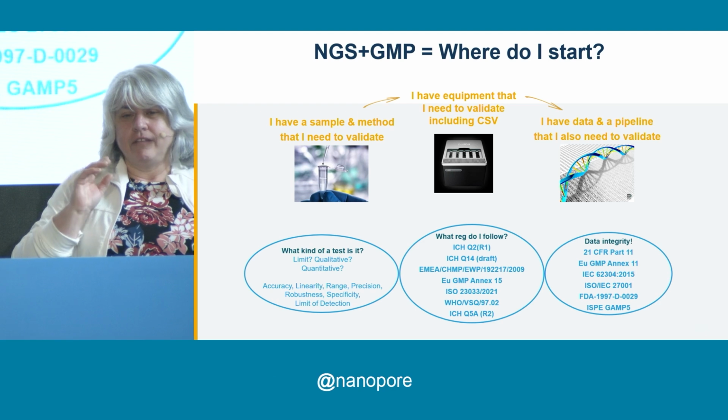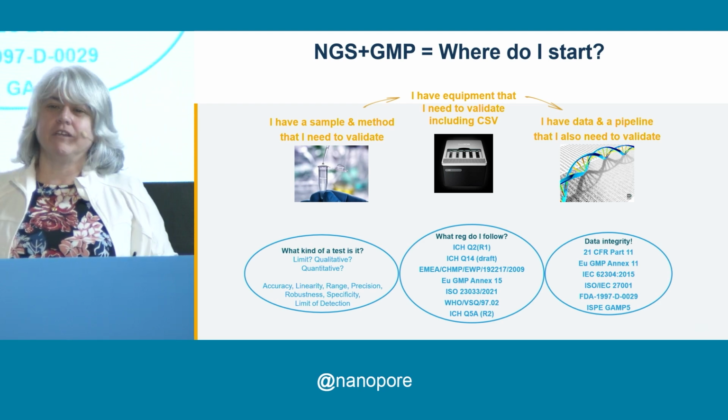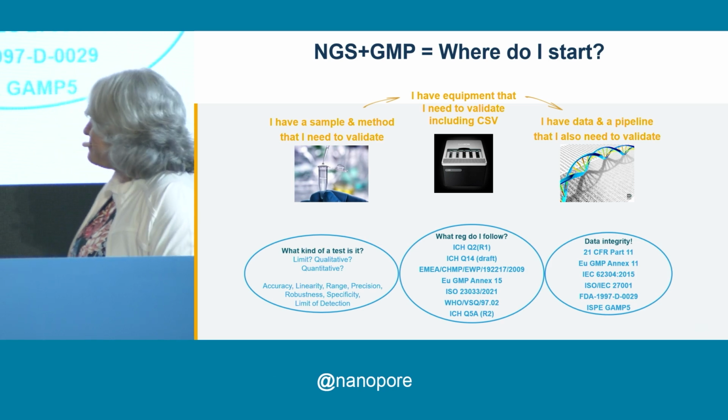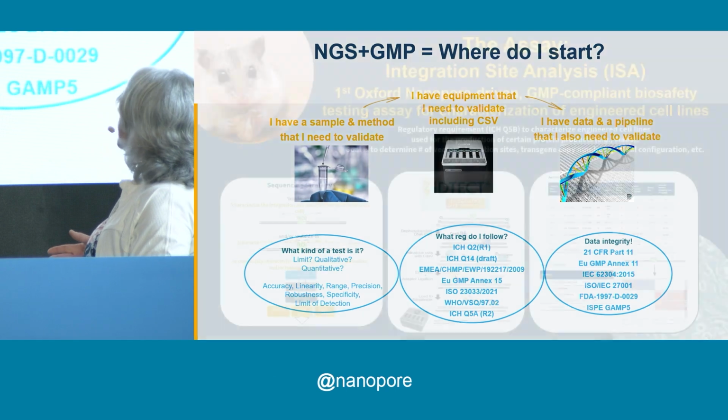So we have to have, and our requests, of course, are, can you maintain a kit, a reagent, a flow cell in legacy? And we get the, well, we don't want to. Like, because that's revalidation, and that's a whole other foray into validation.